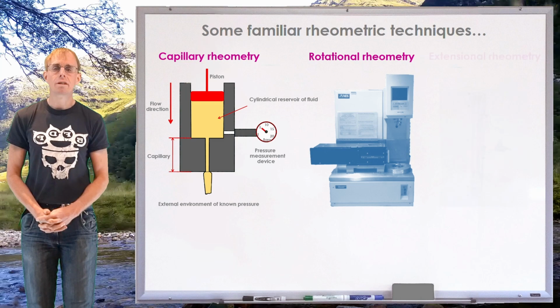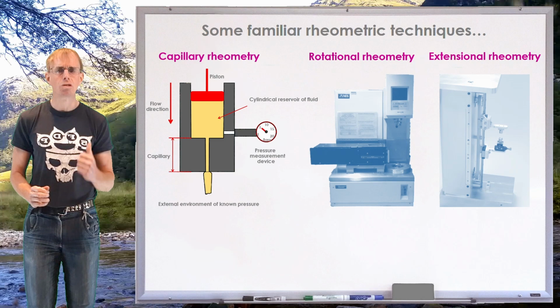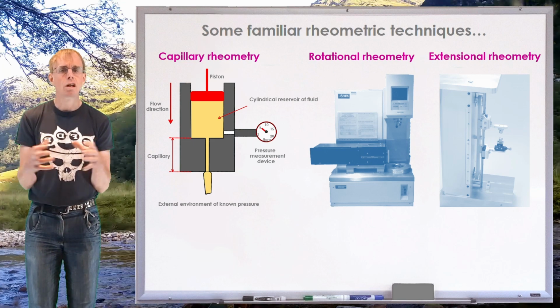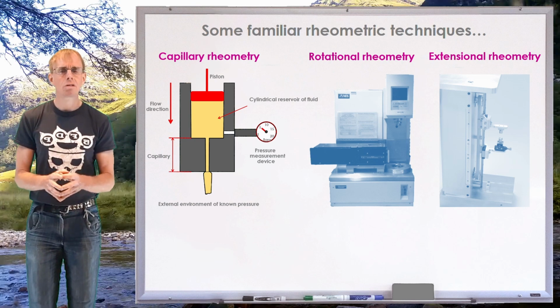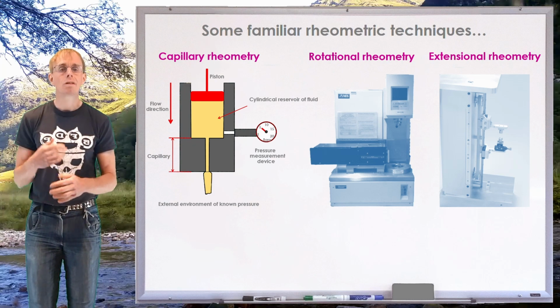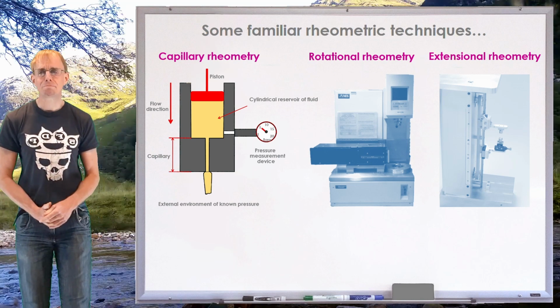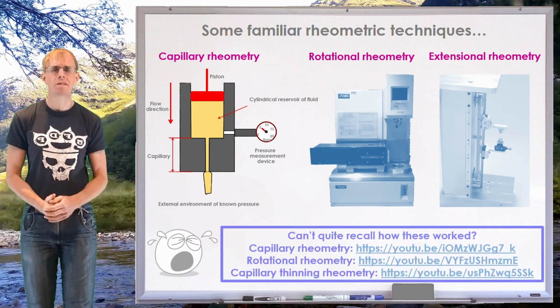We also talked in little depth about extensional rheometry. We focused mostly on polymer solutions, because the extensional rheometry that we talked about mostly was you extend the material and then you let surface tension take over and watch the capillary thinning that then ensues. We can't really do that for polymer melt, so I'm going to highlight in a few minutes how we might adapt extensional rheometry to measure polymer melts, where the thinning timescales under surface tension would probably be days, and therefore utterly impractical.